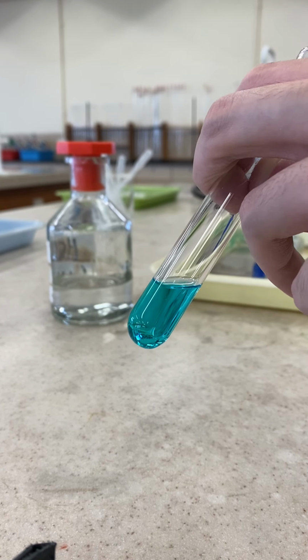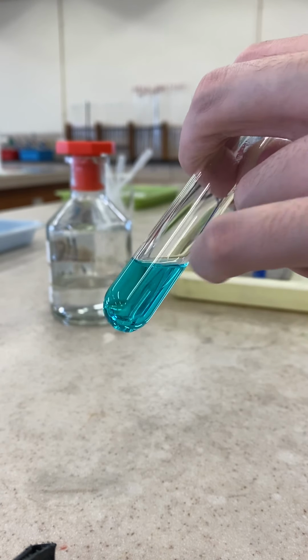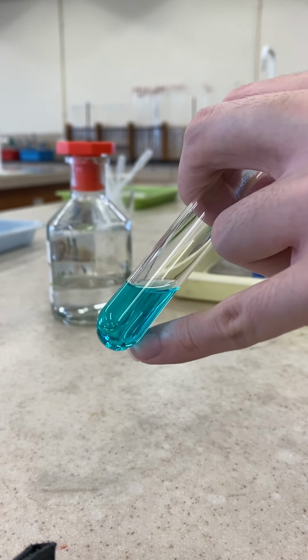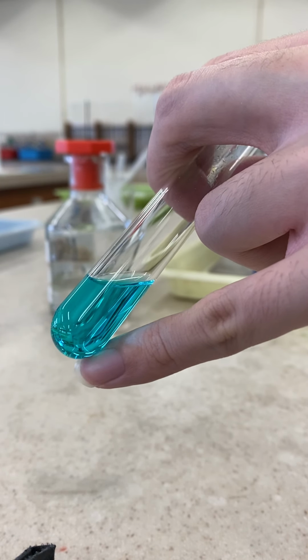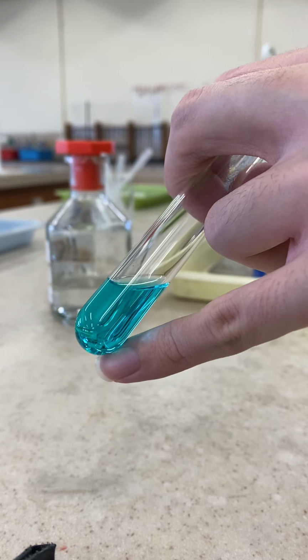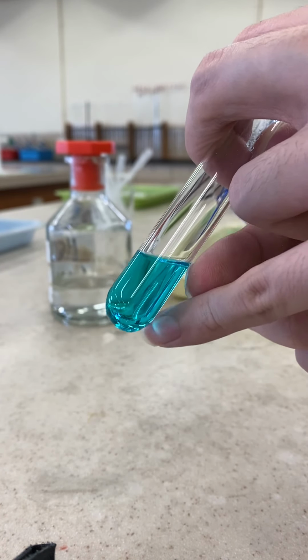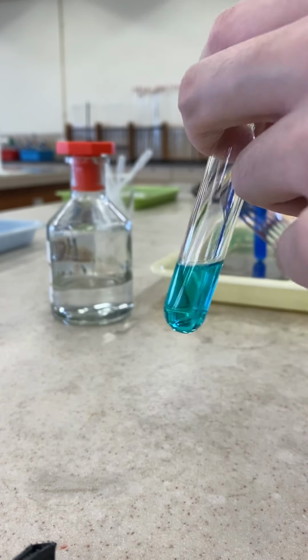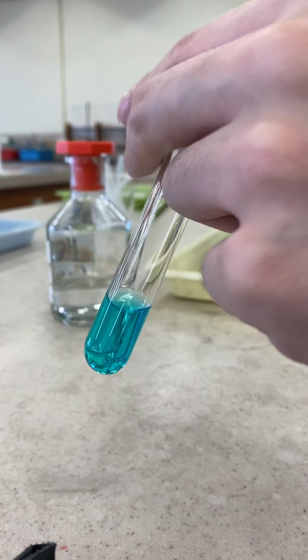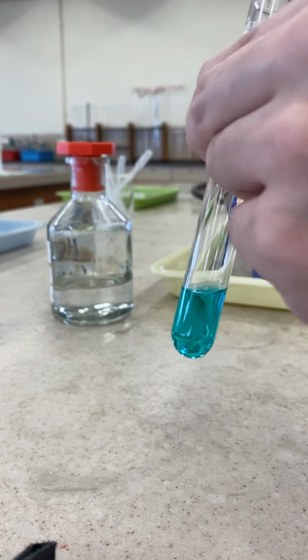The answer should be yes, because originally there was some green solid at the bottom, the copper-2 carbonate, and now it seems to disappear. However, it's not true. It does not really disappear. It is changing into new substances, and this substance is soluble in water. So what you can see is a clear solution afterwards. And this solution is actually copper-2 chloride. And I can show you something more.